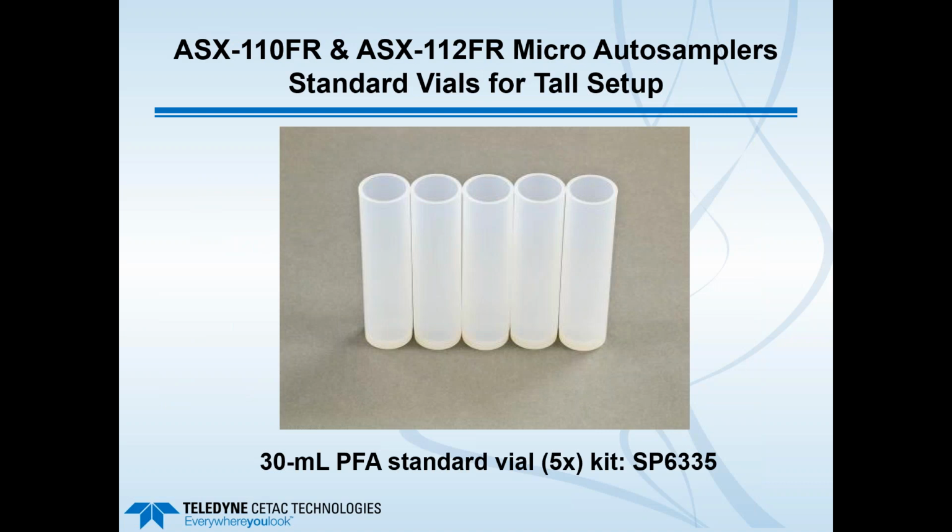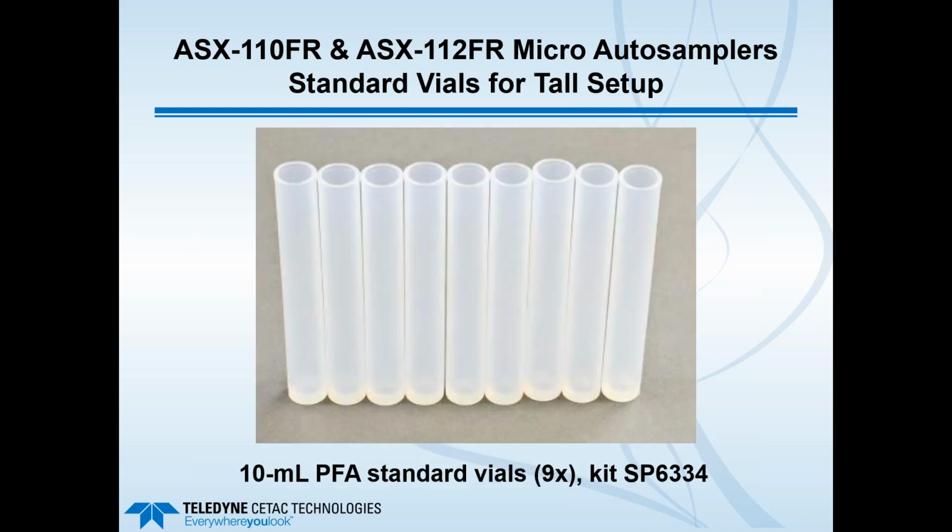So just some pictures of the 30 ml PFA vials. These, of course, are available in the kit. The same type of caps are available for these, if you want to mix standards directly in those vials. There are the 10 ml PFA vials. Again, these all go around the outside of the carousel tray.